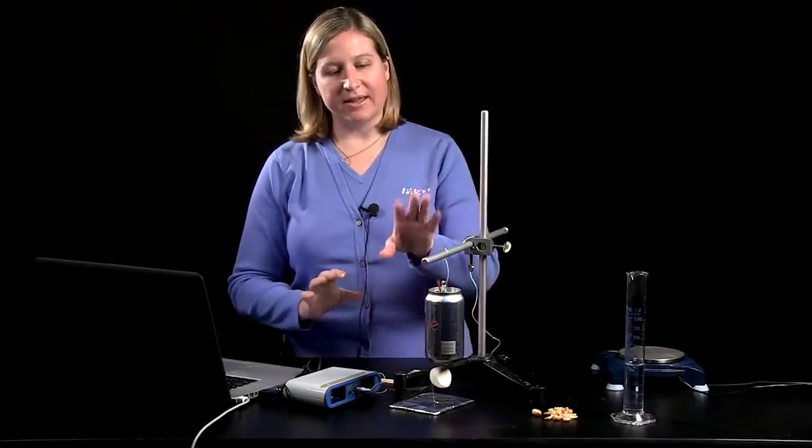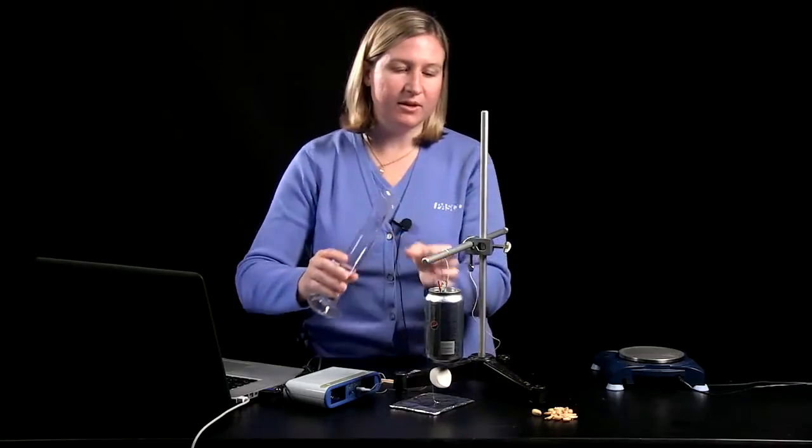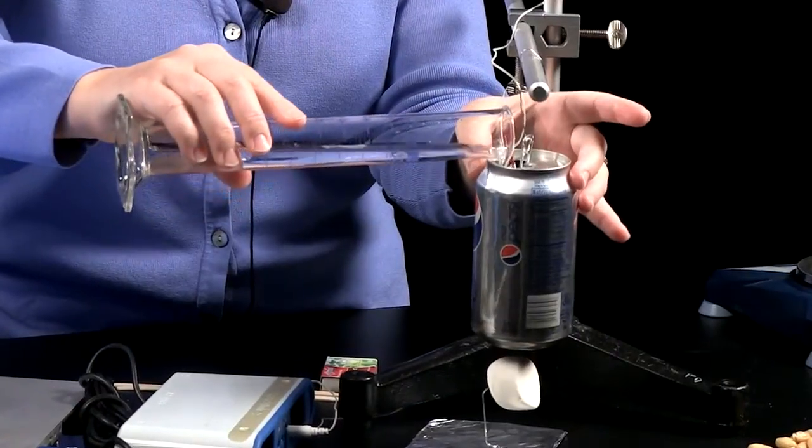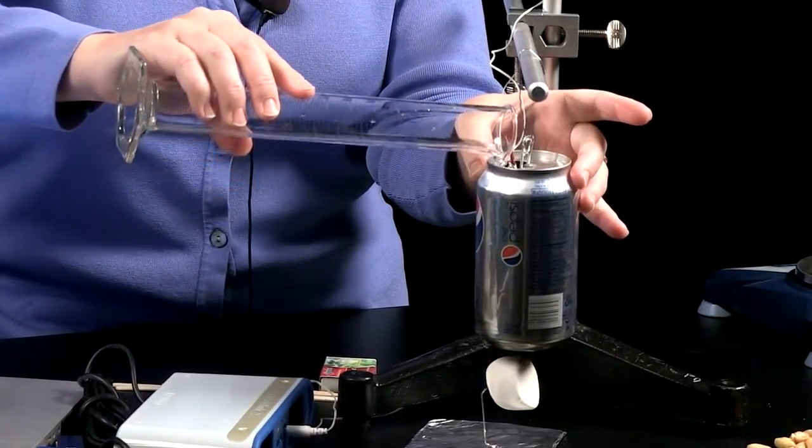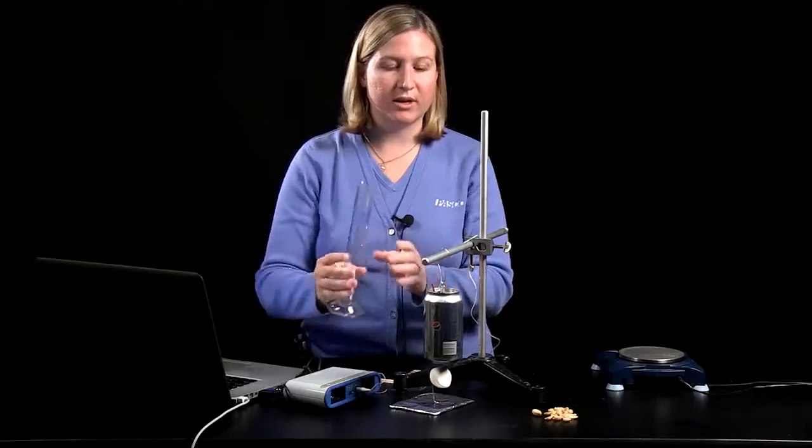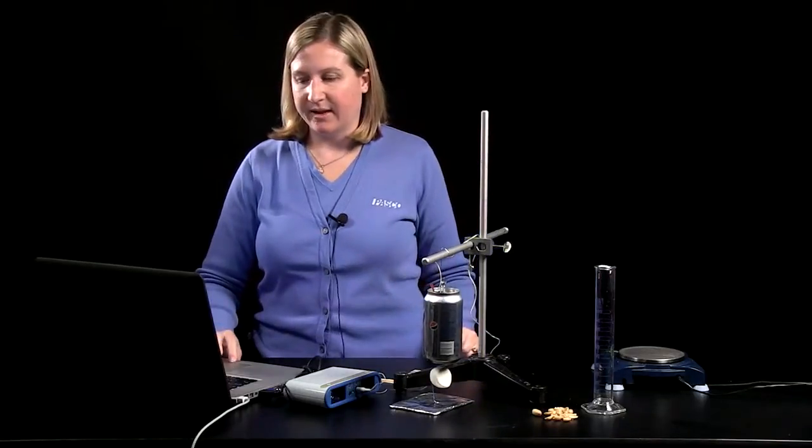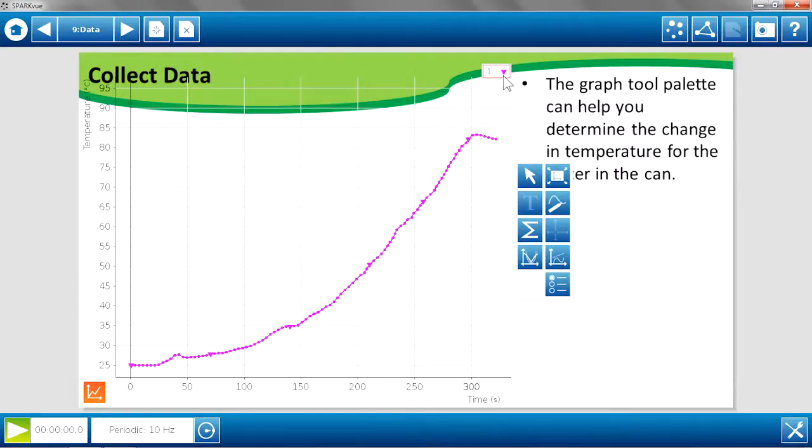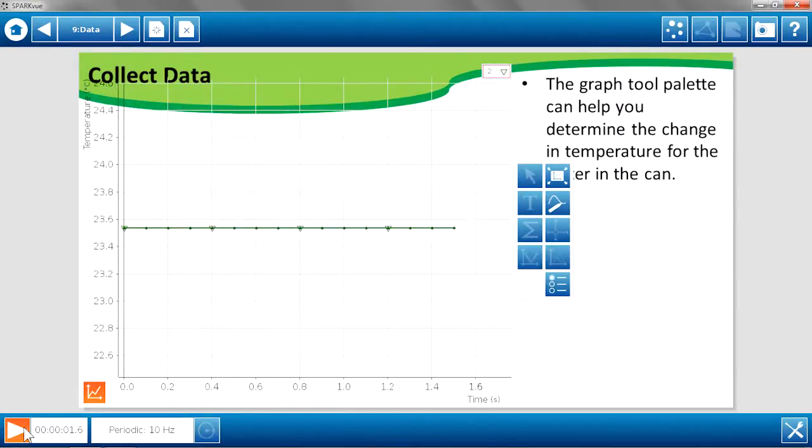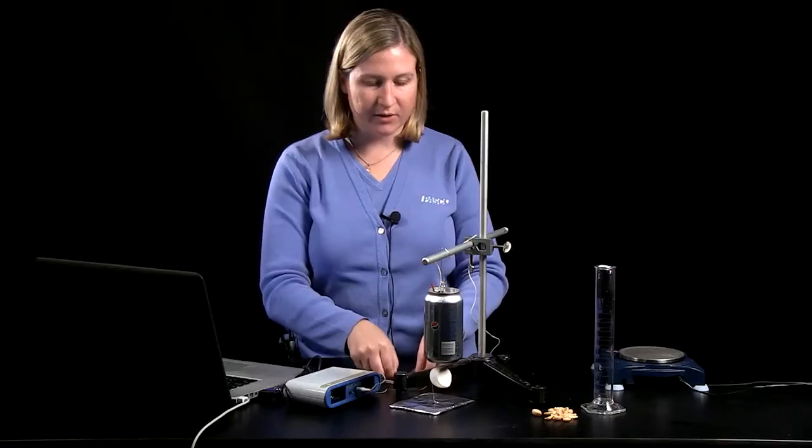So I've got my can. I'm going to add 50 milliliters of water to it. I'm going to start recording temperature of the water in the can by pressing play. You'll see on the graph I already have data for the peanut. I'm going to hide that for the moment so that you're seeing only the data for the marshmallow. So you can see the temperature is remaining the same. The temperature probe is just sitting in the water right now.